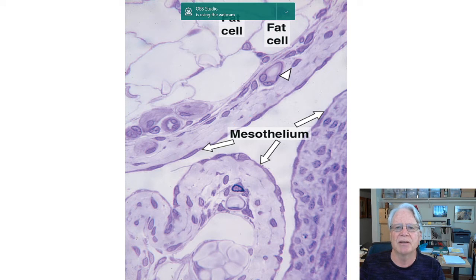So here again, another example. Notice the terminology, mesothelium. I'm going to talk about that in a little bit, but just keep that in mind. There's some terminology here that might get you confused. We're going to straighten that out, and I'll talk about it in much more detail in the lecture. I will cover it a little bit here in this presentation. Again, we have our simple squamous epithelium here, here, and here. Those are all examples of simple squamous epithelium.